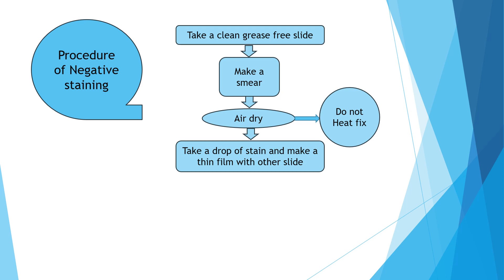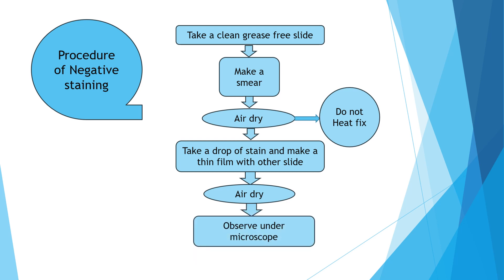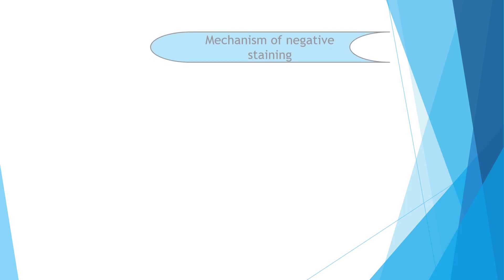After air drying, take a drop of stain and make a thin film with another slide. Generally, we make a smear at the center of the slide. When it gets air dry, take a drop of stain at one edge of the slide and with the help of another slide make a thin film of that stain. Further air dry the thin film and observe under microscope. This is the simple procedure of negative staining.